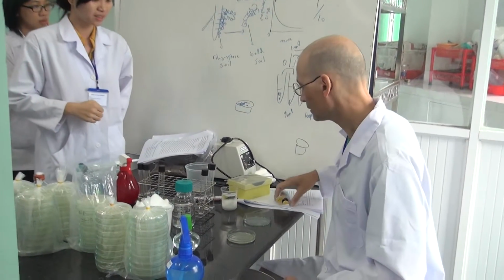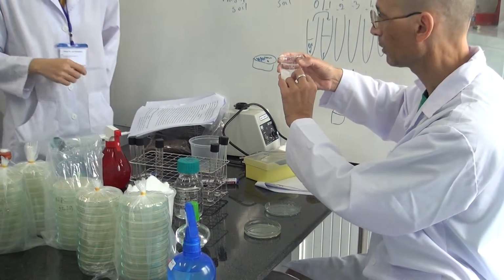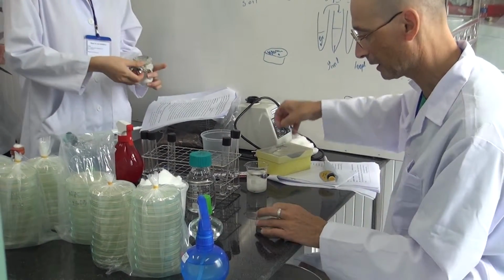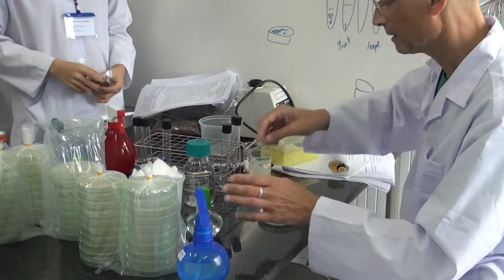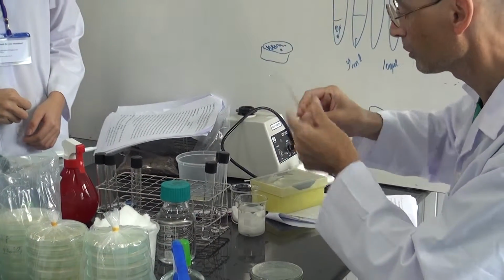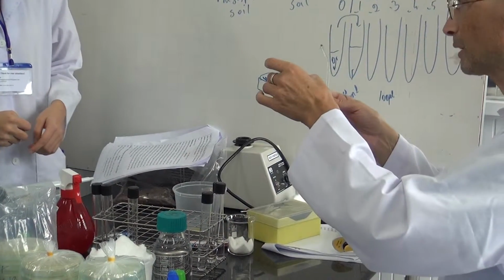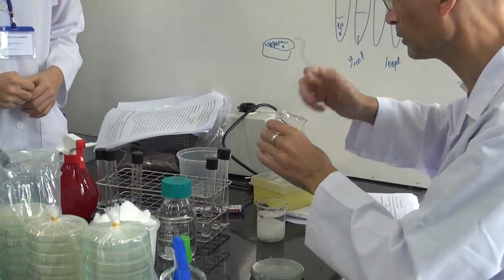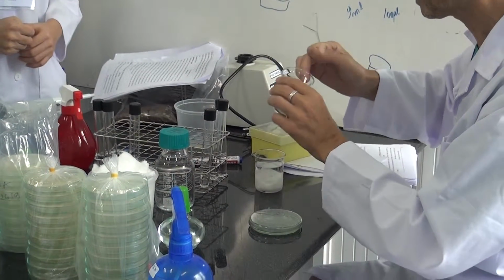Okay. Now, just for safety, I think this is much too much alcohol. Really, because if, for instance, I paid attention, you see, I did that and then put it back. Sometimes I do it. If this is too hot, without a flame, just hot, you put it here, this will start. And with that amount of alcohol is very dangerous. So really, and I never work with this. This is also because this also could burn. So I would prefer.